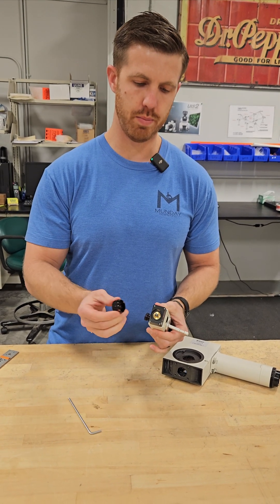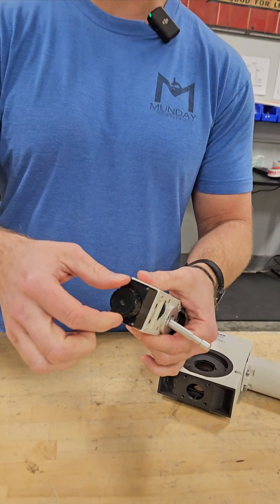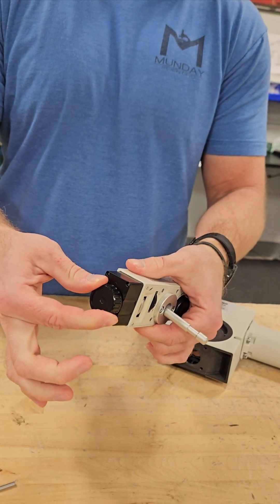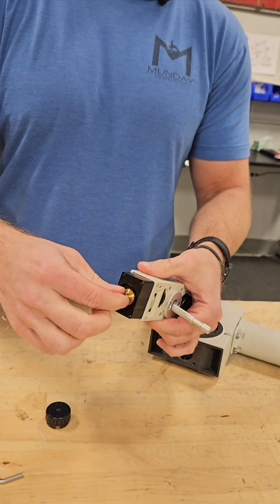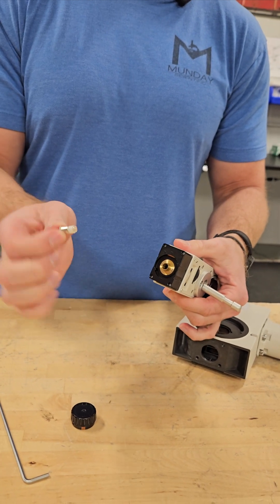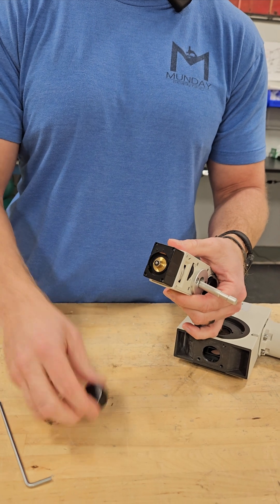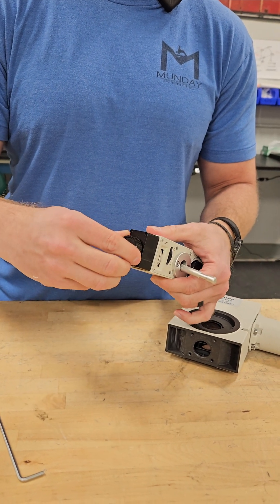If you need to change the bulb, the bulb cap comes off with a twist and it locks in. You would push it in, twist it, and pull it out. There's your bulb. These came with halogen bulbs but we are replacing them with LEDs — they last much longer, are less likely to fail, and they're a lot brighter.